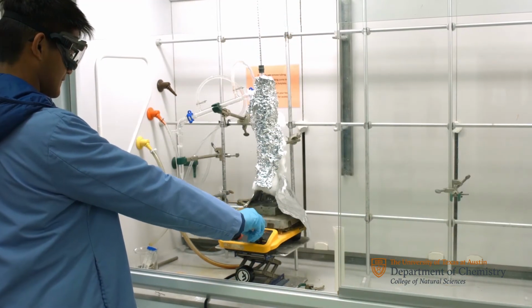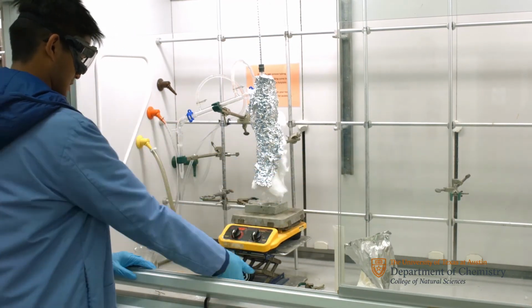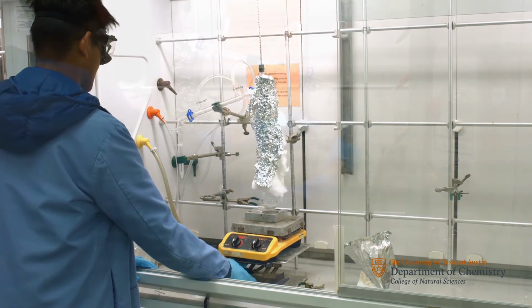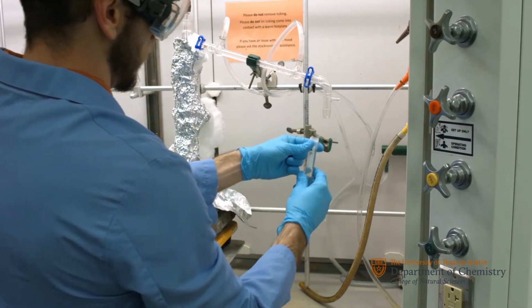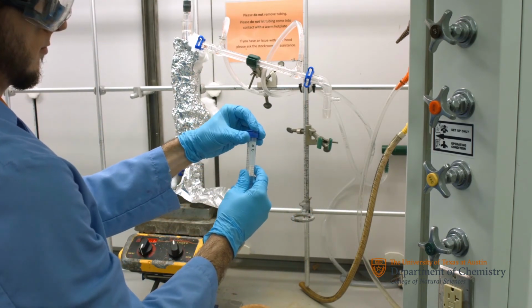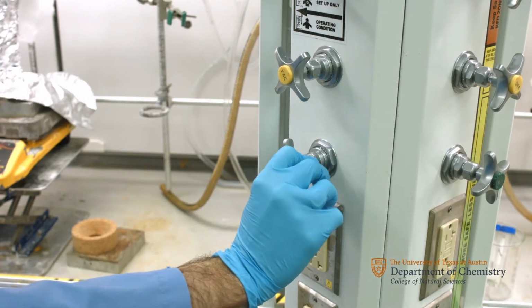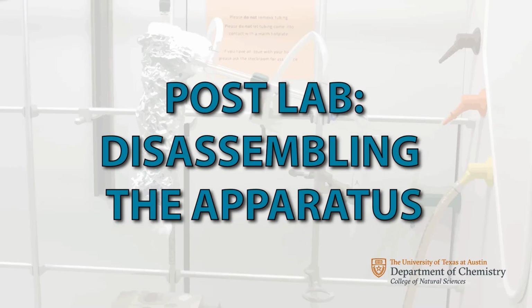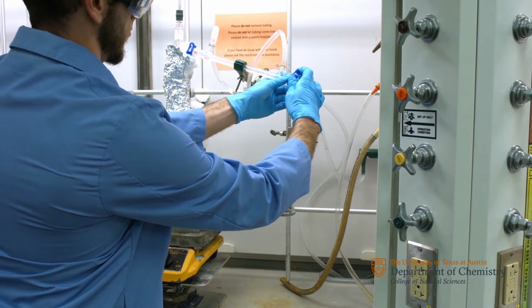When there's about 1 milliliter left in the distillation flask, turn off the hot plate and/or stir plate and lower it with the lab jack. When distillate has stopped dripping into tube C, remove the tube and place a cap onto it. Also turn off the water. When the apparatus has cooled, start to disassemble it.